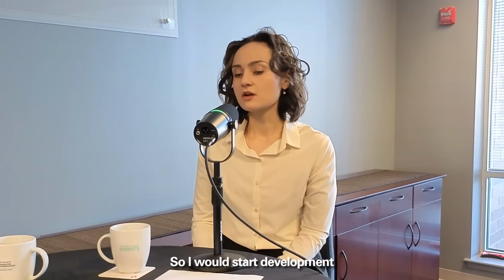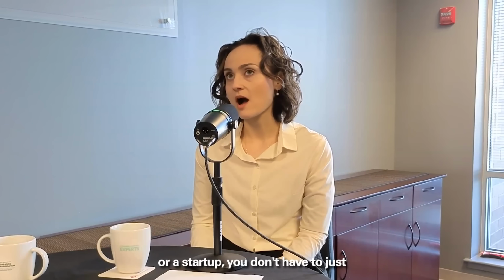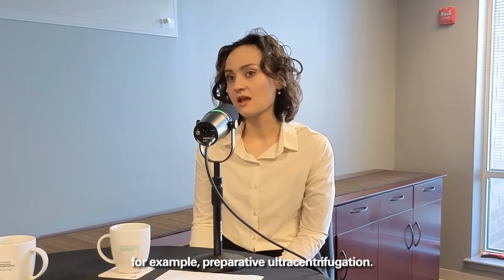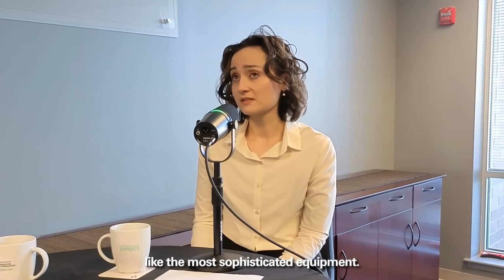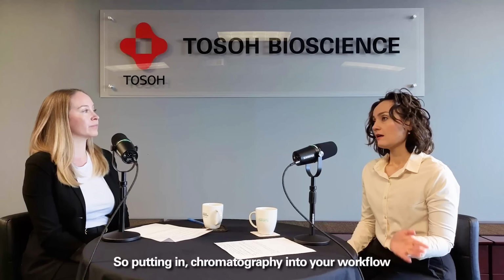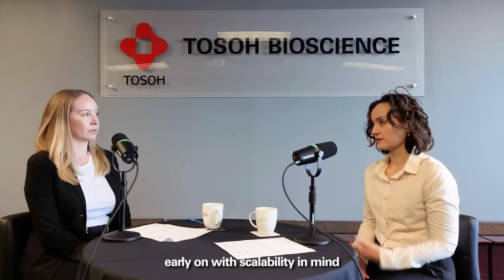So I would start development with scalability in mind. Even if you're an academic research group or a startup, you don't have to just stick with, for example, preparative ultracentrifugation. It's very simple to get these chromatographic methods up and running, even without the most sophisticated equipment. So putting chromatography into your workflow early on with scalability in mind is something I would definitely recommend.